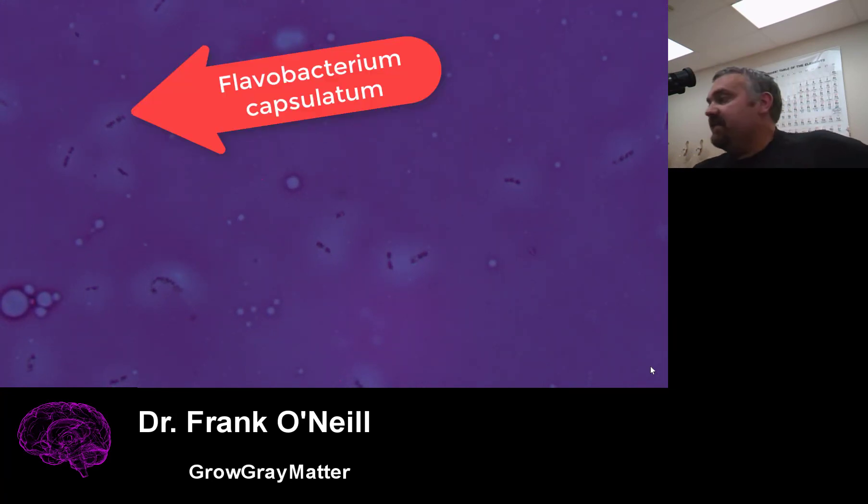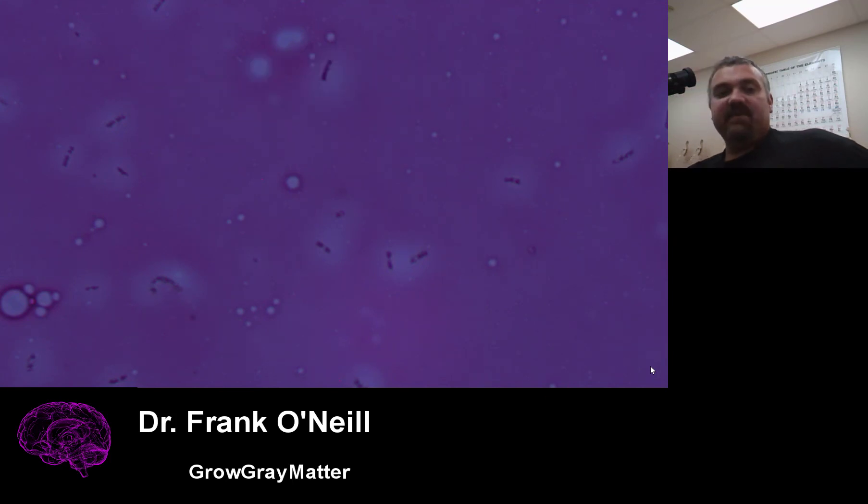Okay. So that's the negative stain or the background stain that allows us to visualize the capsule by the fact that they're not being stained. So that is another example of how to use the oil immersion objective. And that is a capsule stain.